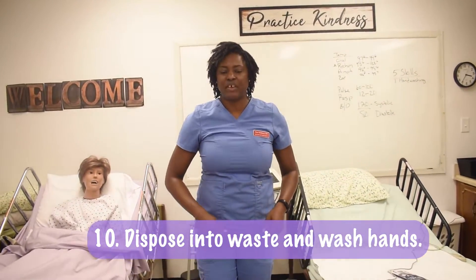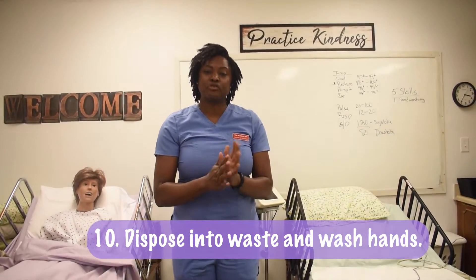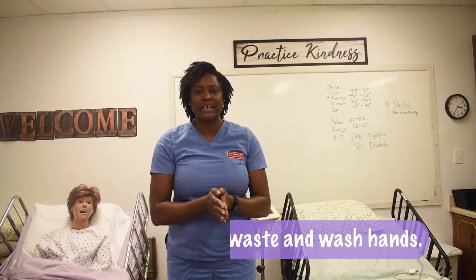Dispose in the trash receptacle. Wash your hands and the skill is complete.